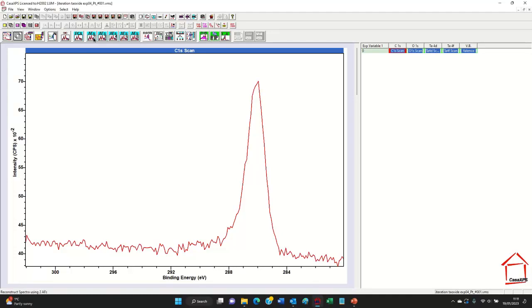So these are all options for creating abstract factors. You can normalize. This is something that would previously been on the spectrum processing calculator property page. Rebinning spectra, where the intensity and the energy calibration needs to be aligned for uses with PCA or other linear algebra techniques.